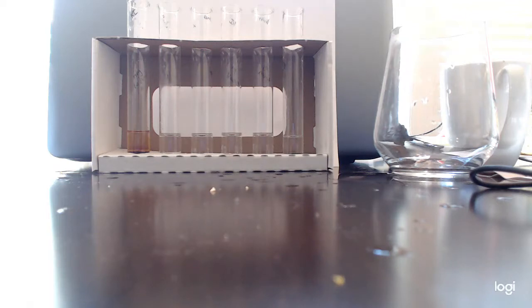And y'all don't know this, but behind the camera, this table is a hot mess of stuff. I should have put down some sort of chemical diaper. We're going to do the Biuret test next. And think about for a second what it tests for. If you're thinking that the Biuret test tests for protein, you're correct. 20 drops.